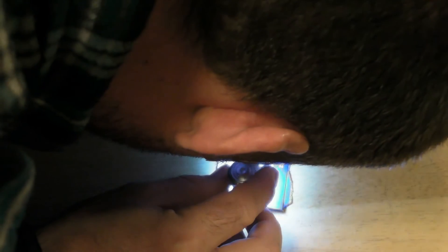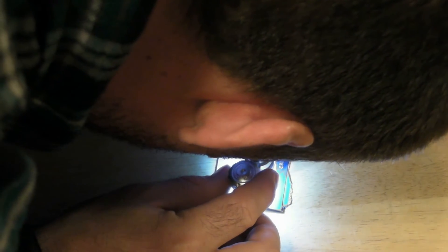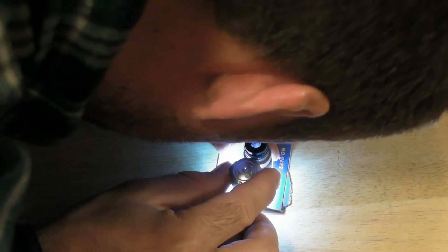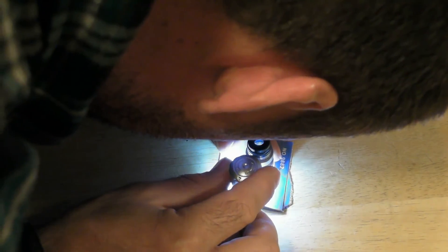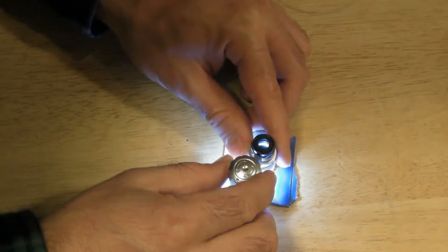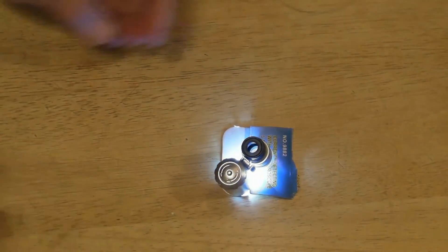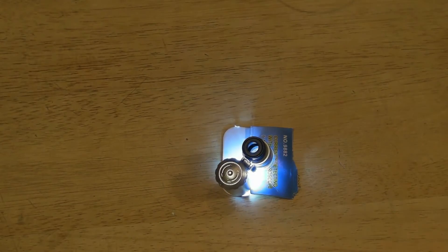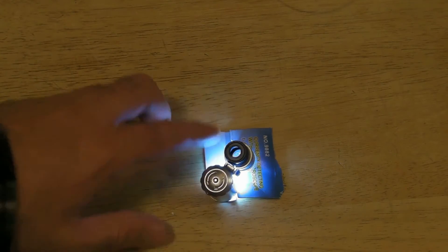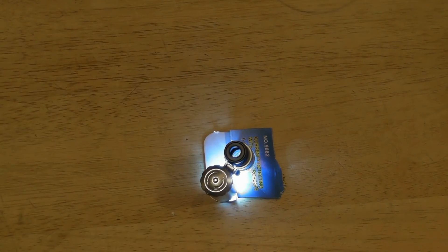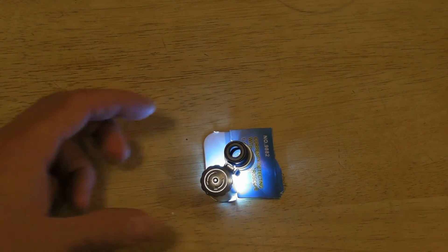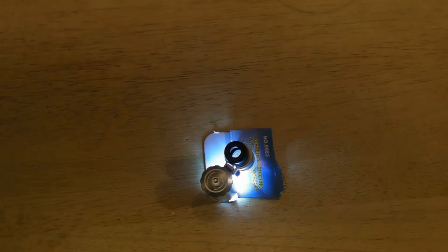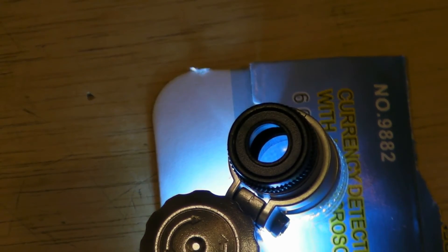So this is actually a really nice magnifier. I see the pixelation, the pixels of the ink that printed in this packaging. I can see the little dots of ink, the multi colors. I'm going to try to, I don't know if this will be possible, but I'm just going to try this. You can kind of see it right now.